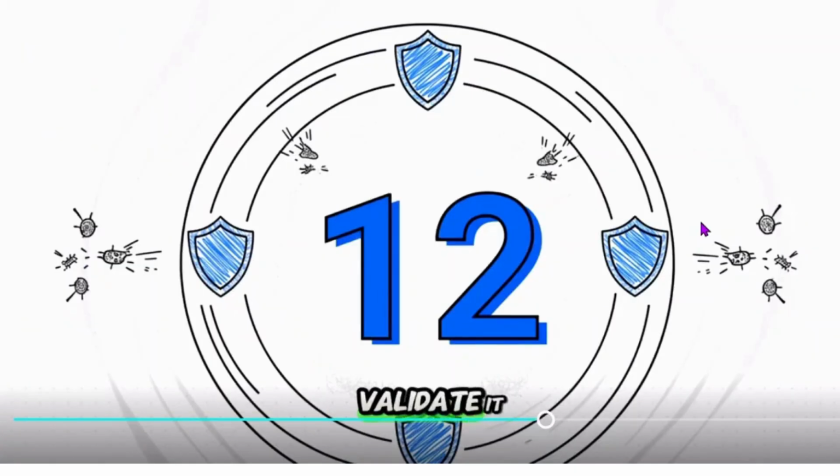So what's the magic number? Well, while the targets can definitely vary, an F0 value of 12 is a really common benchmark in the industry. So why 12? It's all about achieving this incredible safety margin called a Sterility Assurance Level, or SAL. It means the statistical probability of a single contaminated item making it through is less than 1 in a million. Think about that. That's not just sterile, it's sterile validated to an extreme degree of certainty.